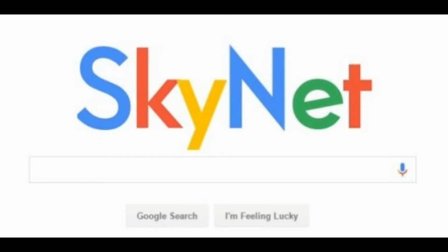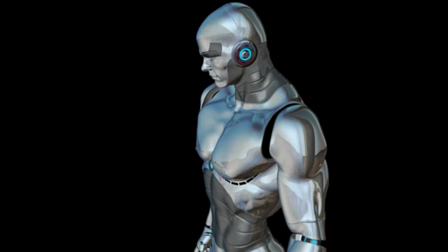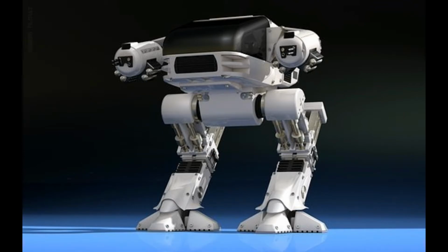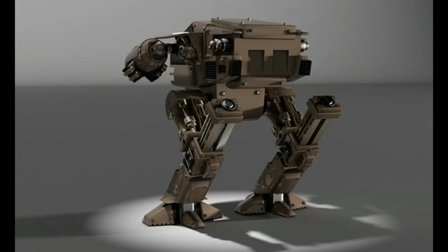On the side of our future robotic overlords is the analytical lab machinery, comprised of high pressure liquid chromatography, gas chromatography, and mass and isotope specific spectroscopy. This channel welcomes our future robotic overlords and wishes them well in the coming match. The machinery making up this team ranges from 100,000 euros and more for each unit, and a dedicated lab.